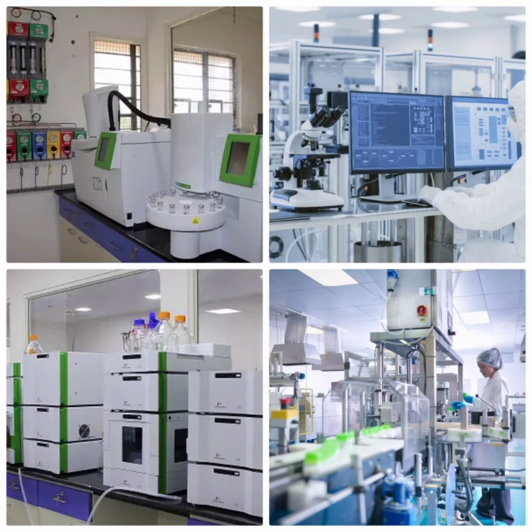Let us compare the two techniques vis-à-vis the nature of compounds. Gas chromatography separations are mainly carried out on compounds ranging in molecular weight up to a few hundred. Such compounds separate on differences in volatilities and remain stable at high temperatures. That is the reason why we said at the beginning that gas chromatography is suitable for the separation of petroleum fractions, meaning the petroleum industry.